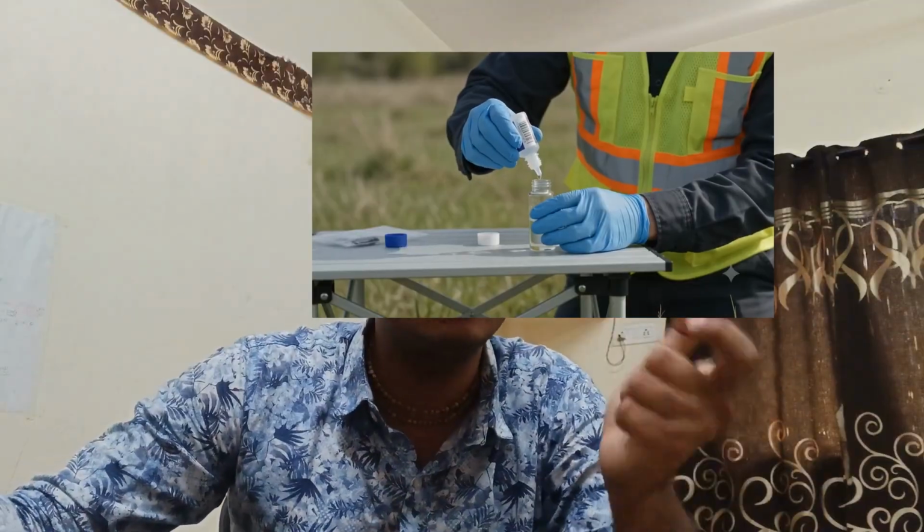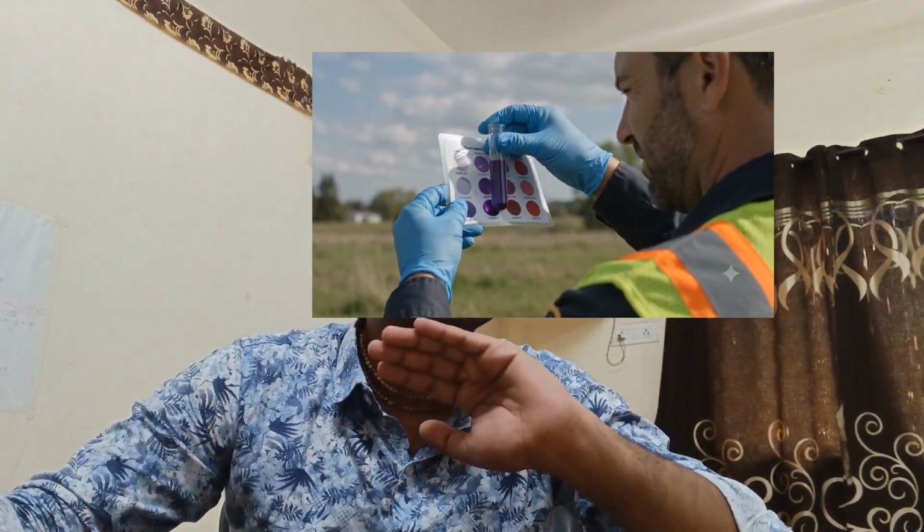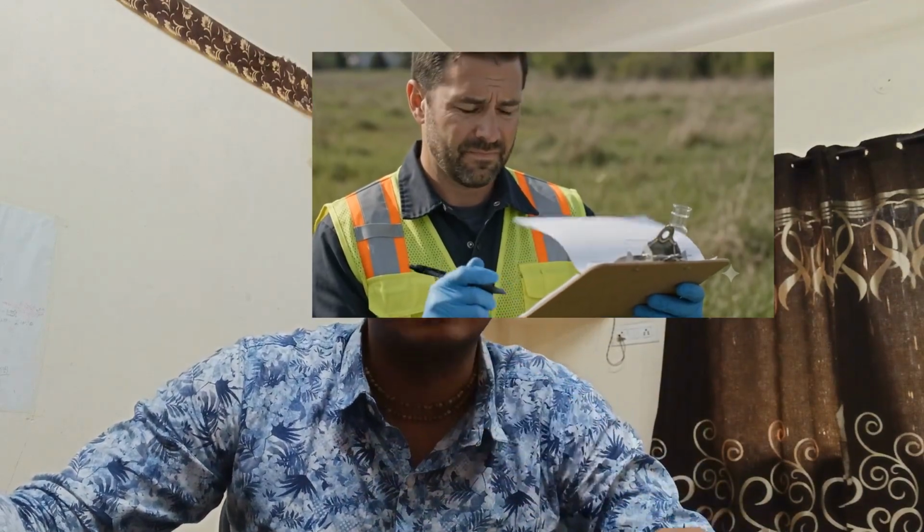So the traditional spot testing process is used basically for speed and to know in what direction we need to take our investigation, right? With the traditional process, it's very simple. You take the sample, you add the reagent, you observe the color, compare it with the reference chart, and that's it. The chemistry is easy and quite effective, but the problem is how we interpret and document that chemistry.